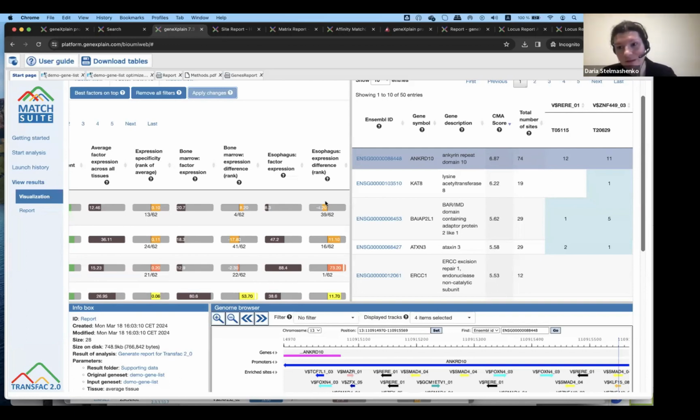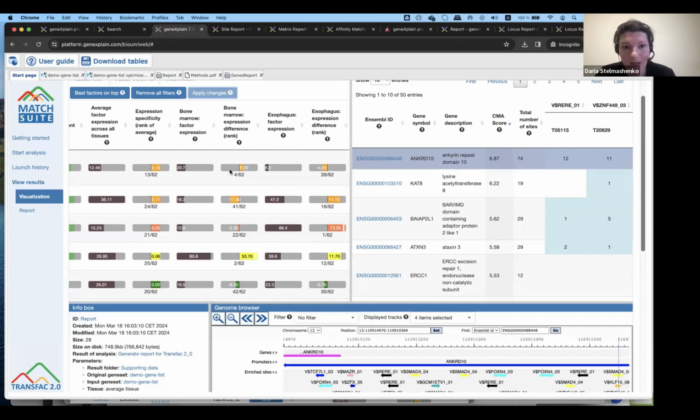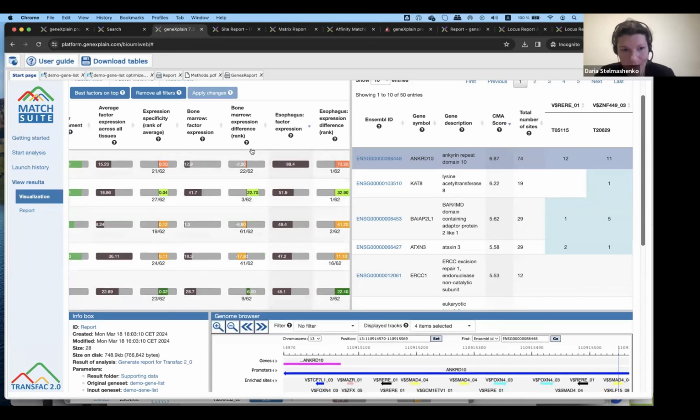But it is a very interesting type of filtering. You can really fine-tune the results, and maybe you can make interesting investigations with such filtering, which takes just a couple of seconds, as you saw. You might play around with applying different filters by tissues of your interest, and you see immediately the values that were calculated for those tissues, and you can sort, of course. You can find those with the bigger difference from average and the bigger levels of expression in this tissue.